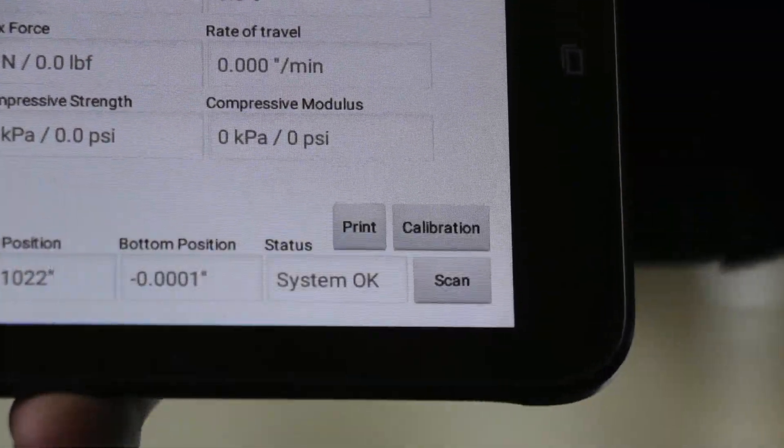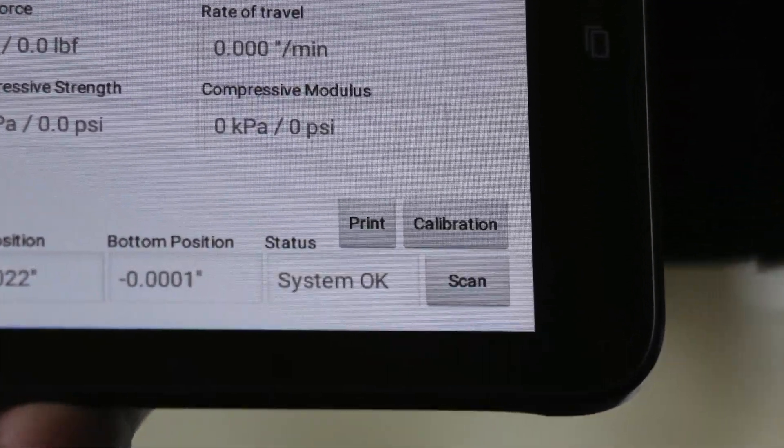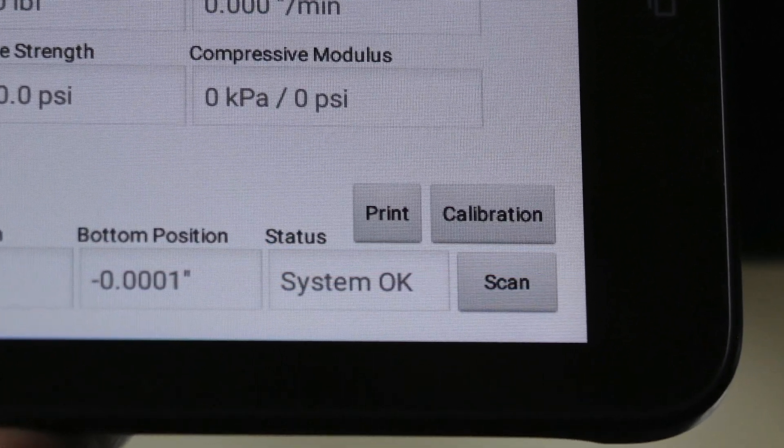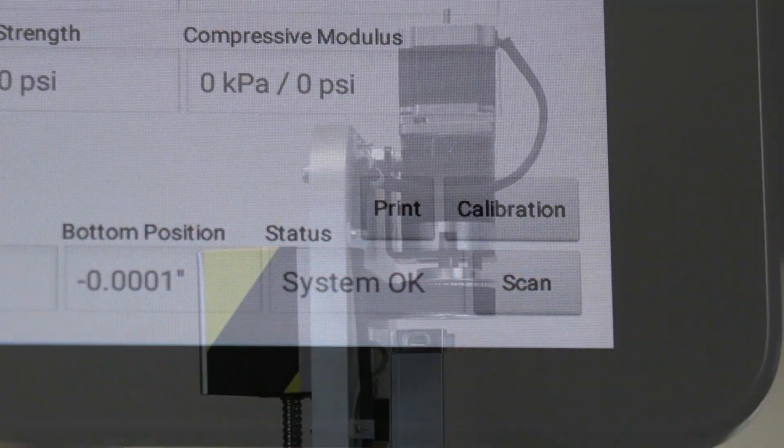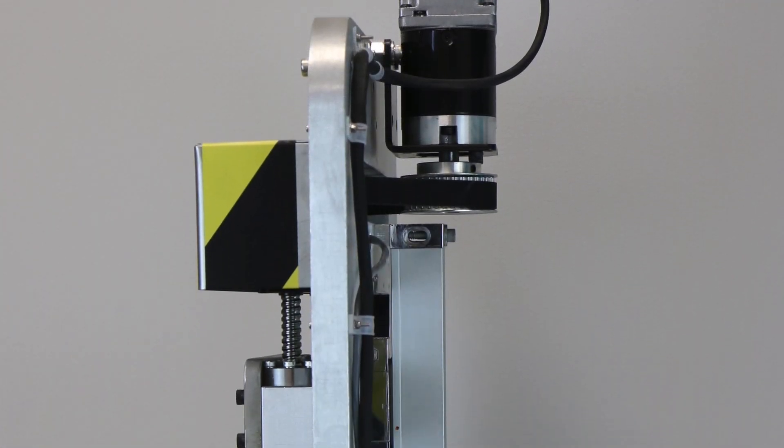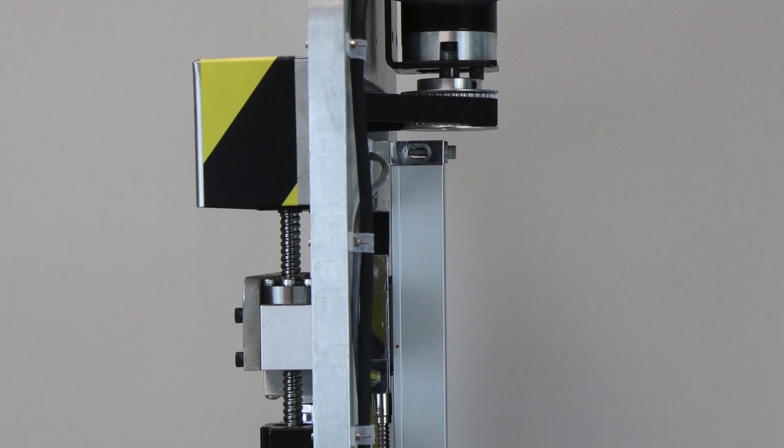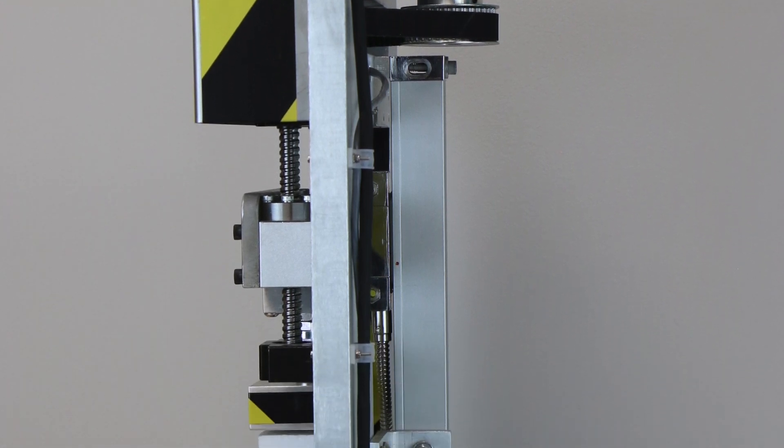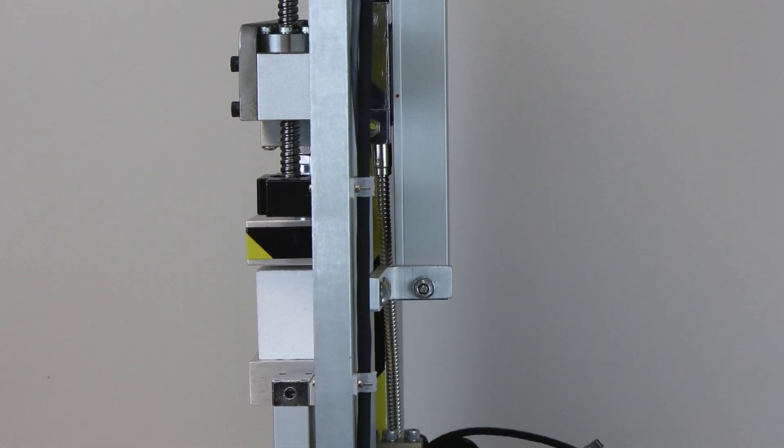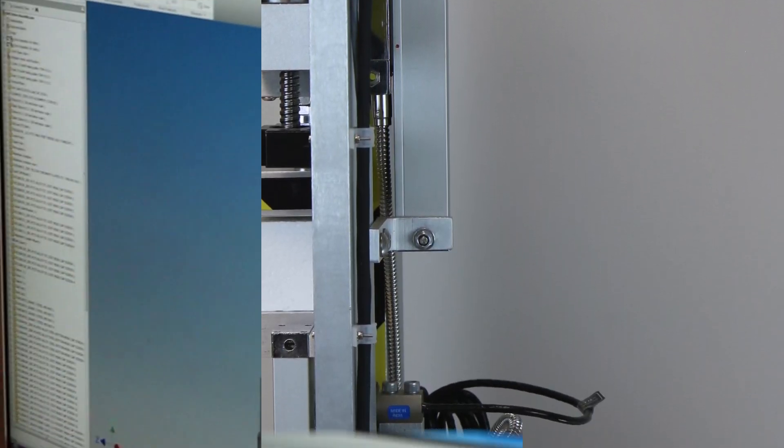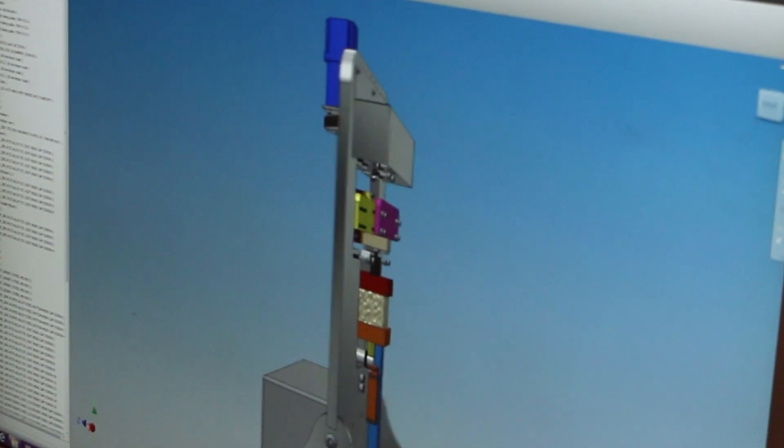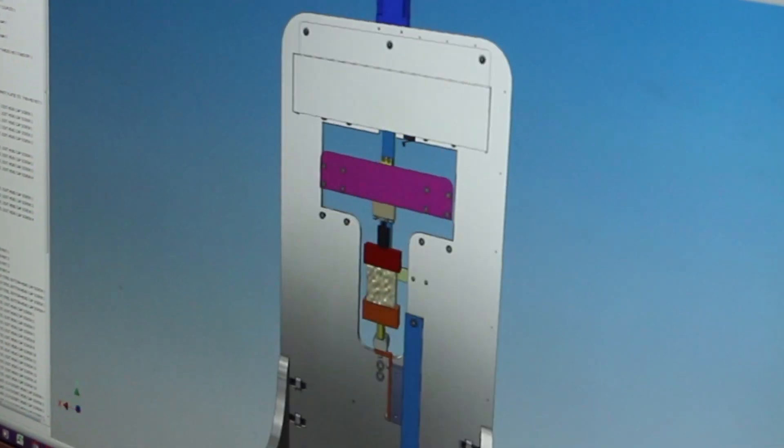Easily print test results by clicking on the print icon. This calibrated, efficient system from TestPro Equipment can be configured to test a variety of sample sizes and materials which need to undergo compressive testing.